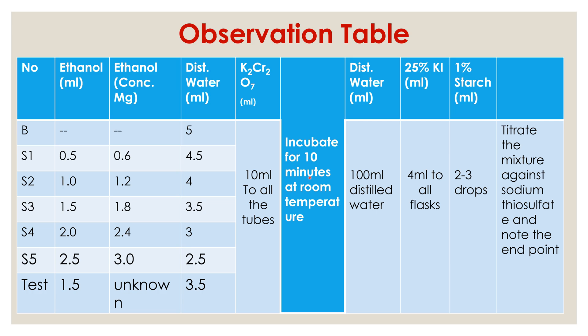After 10 minutes, take conical flasks, add 100 ml of distilled water to each, and pour in the respective test tube mixture. Then add 4 ml of potassium iodide to each conical flask, followed by 2 to 3 drops of starch solution as an indicator. Titrate the mixture against sodium thiosulphate and note the end point.